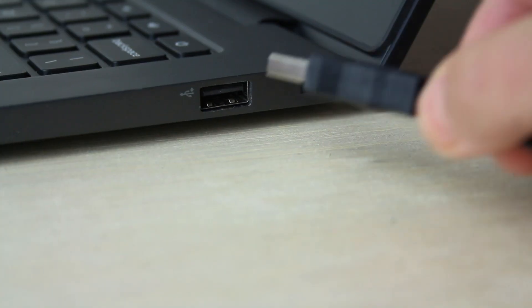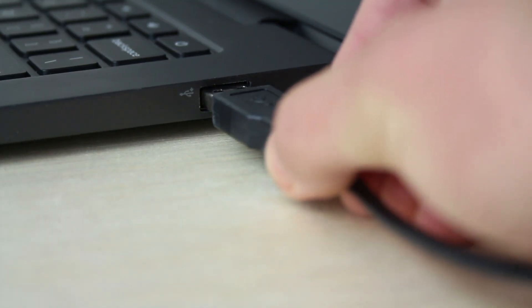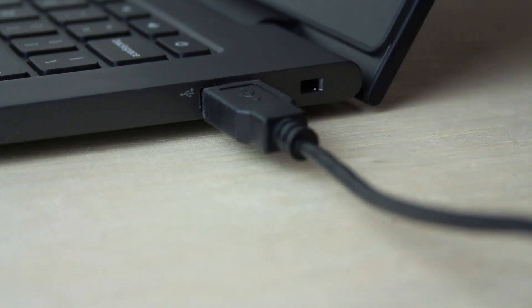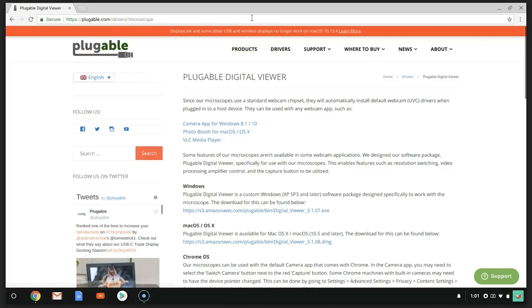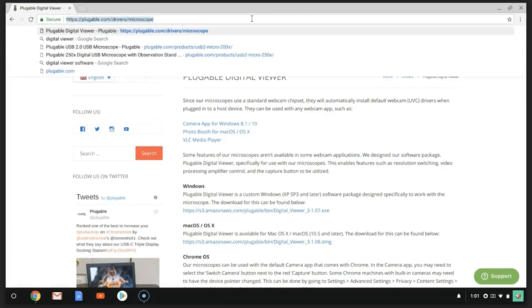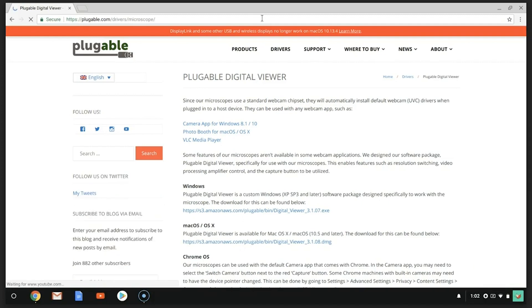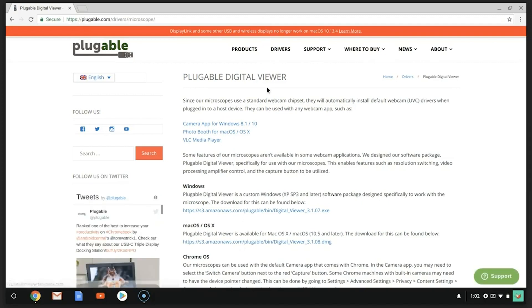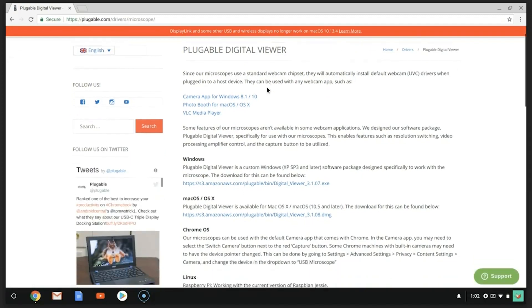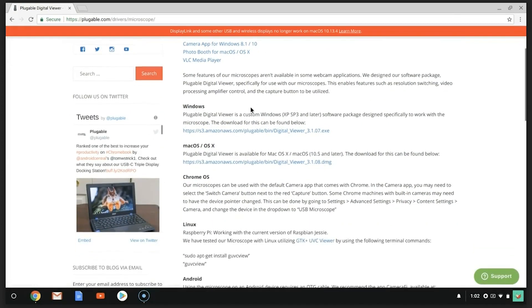Once you insert the microscope's USB cord into your device, open your web browser. Go to pluggable.com/drivers/microscope. Scroll down to Chrome OS, where we've outlined instructions, or follow along as we walk you through the steps.